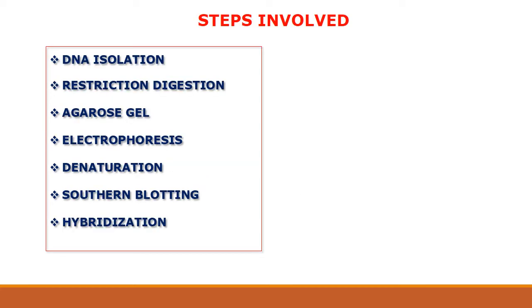The basic technique of identifying such restriction fragment length polymorphisms involves fragmenting a sample of DNA with a restriction enzyme. A restriction enzyme is an enzyme involved in cutting the DNA molecule, which recognizes and cuts the DNA wherever a short sequence occurs, in a process known as restriction digest. Then, the resulting DNA fragments are separated by length through a process known as agarose gel electrophoresis.